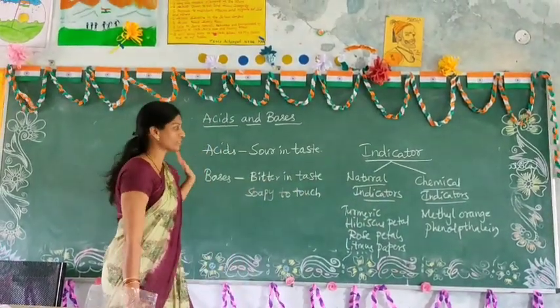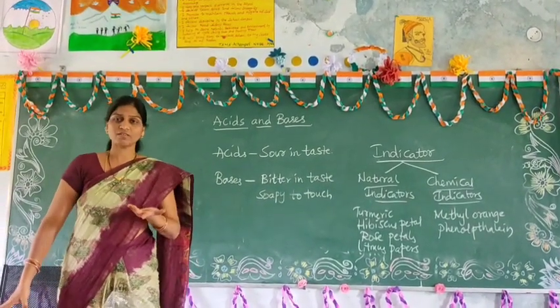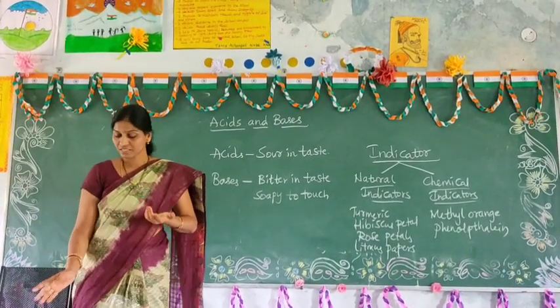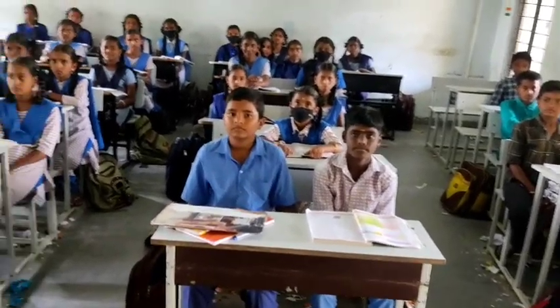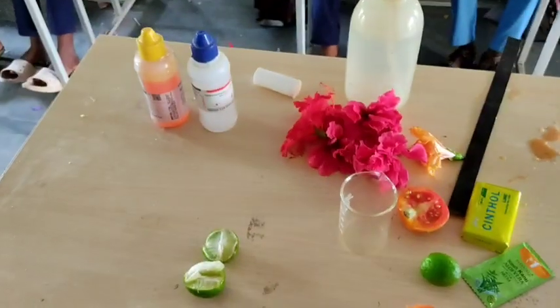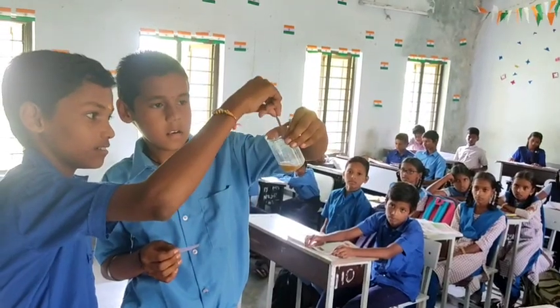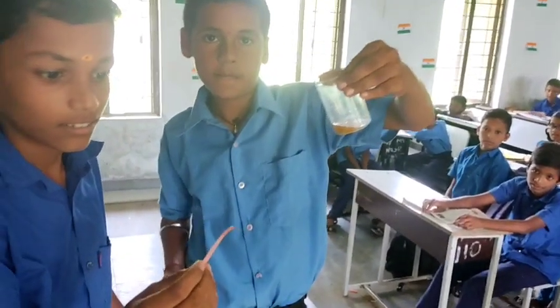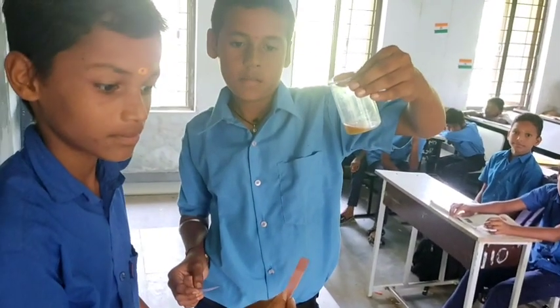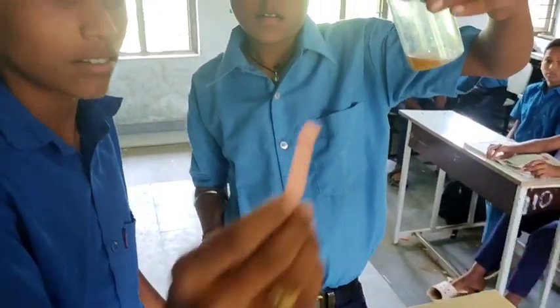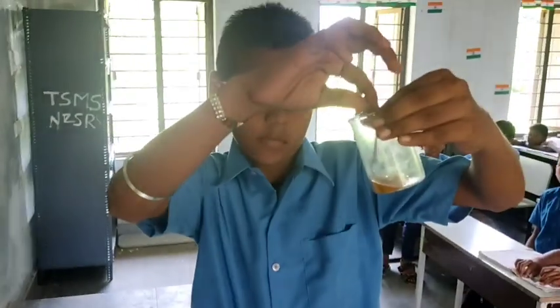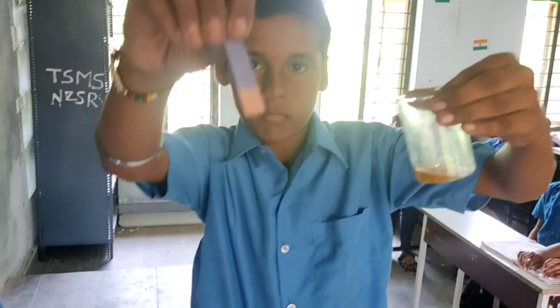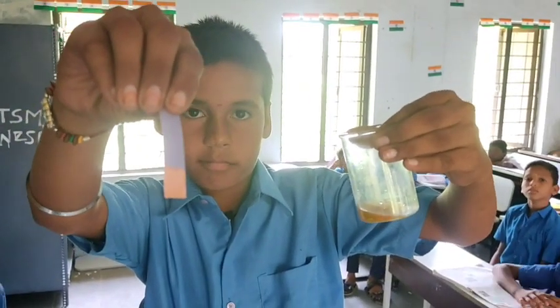We have already studied all these things. Now we are going to perform certain activities to find out whether the given substance is an Acid or a Base. We are testing Tomato Juice. First, we dipped the Red Litmus Paper into the Tomato Juice — it remains red in color. Next, we dip the Blue Litmus Paper and observe the color change — the Blue Litmus Paper has changed to red in color.